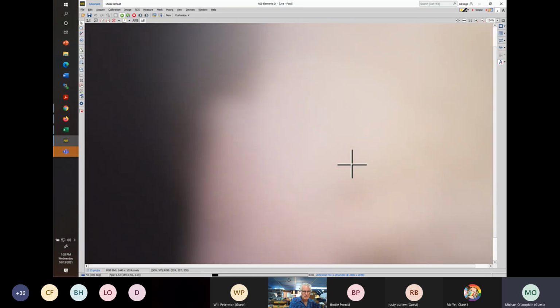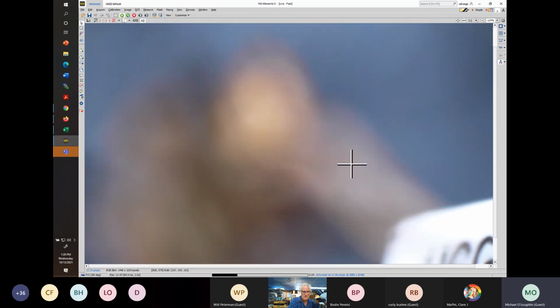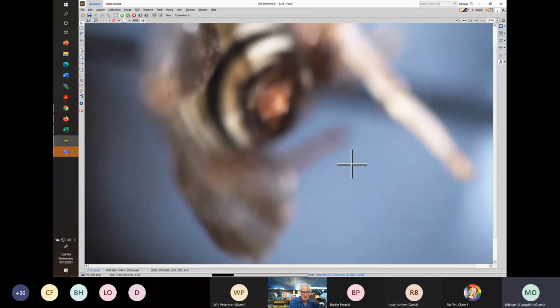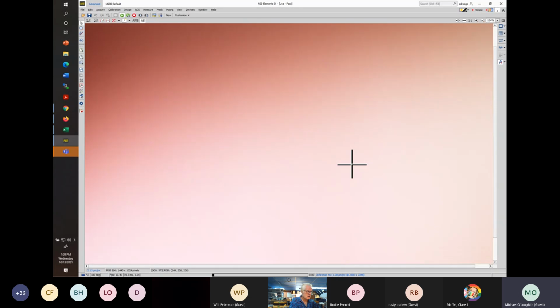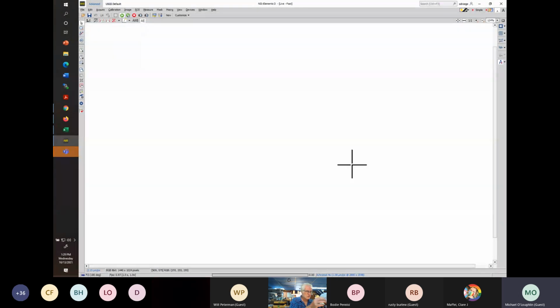So again, like I'm saying, we're spending extra time here because I have never used this character. I'm trying to make sure that we're looking at a male again. Okay, there's another male. So yet another specimen for which we will try and find its tooth.